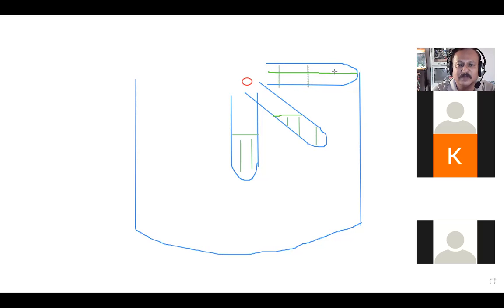So this is how the sample components are moving. And last time, I think with a blue arrow, I also showed the direction of the movement. It is like this. And here the movement is like this. Is it clear to everybody?